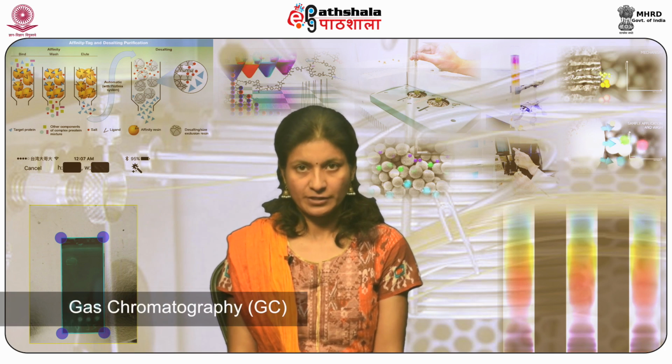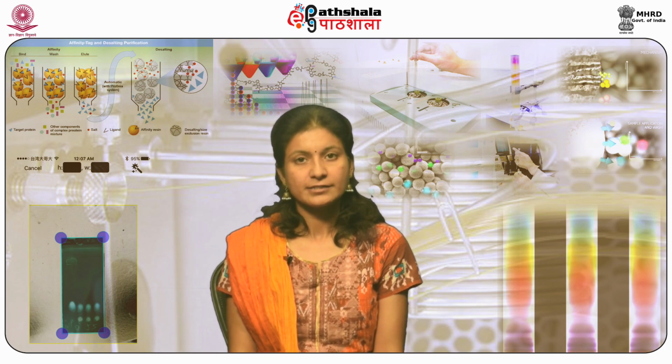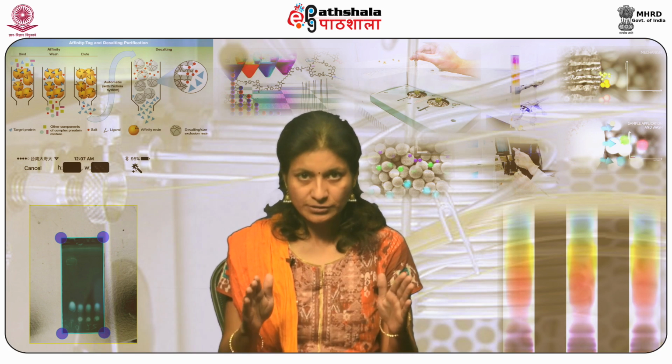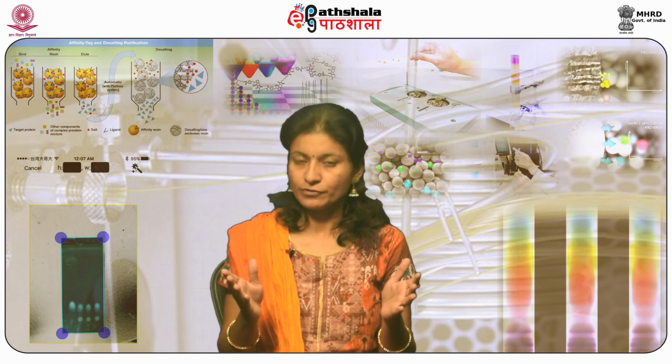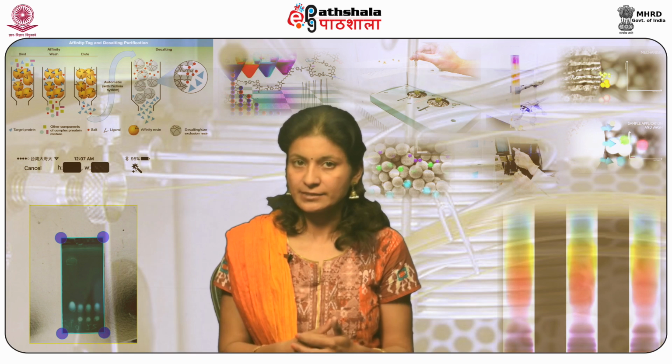Gas chromatography, or gas liquid chromatography, GLC or GC, is a technique which is used for separation, identification and quantification of components of a mixture of volatile substances.